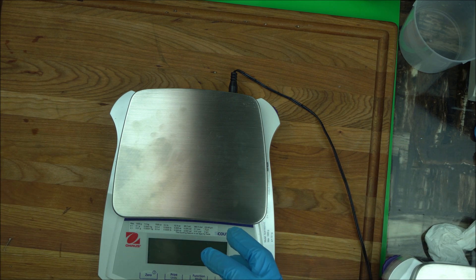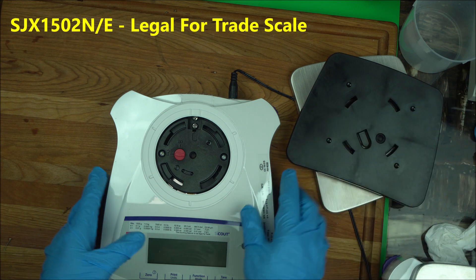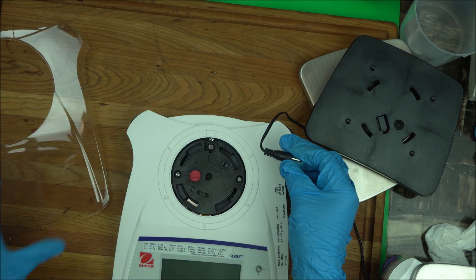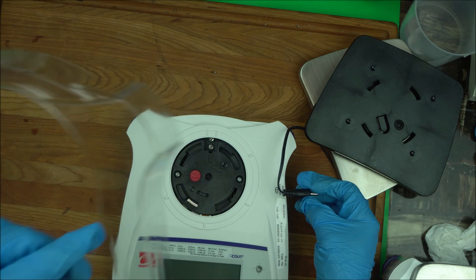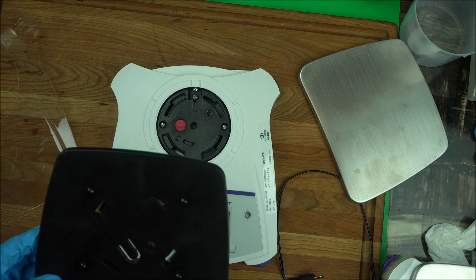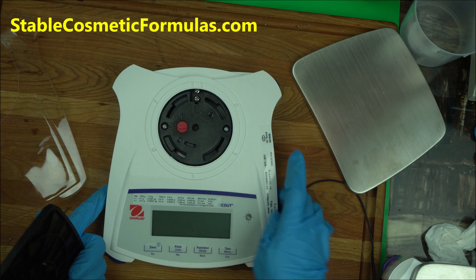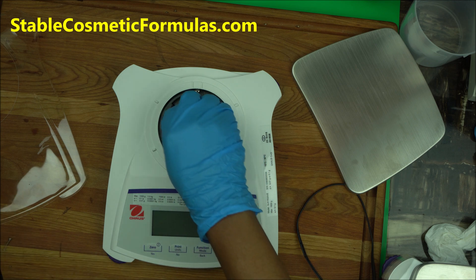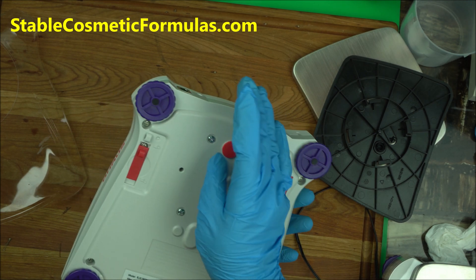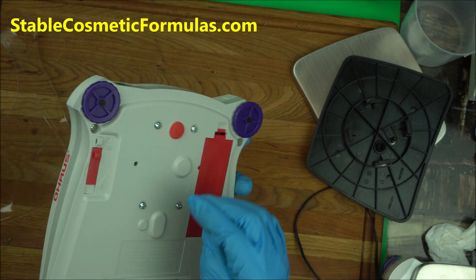When you get it, the setup instructions are very clear and I can quickly go over them with you. It's going to come from the box with an adapter, and it's going to come with a pan. Now at this point, some of them might even come from the back locked, so the first thing you want to do when you take it out of the box is unlock that side.